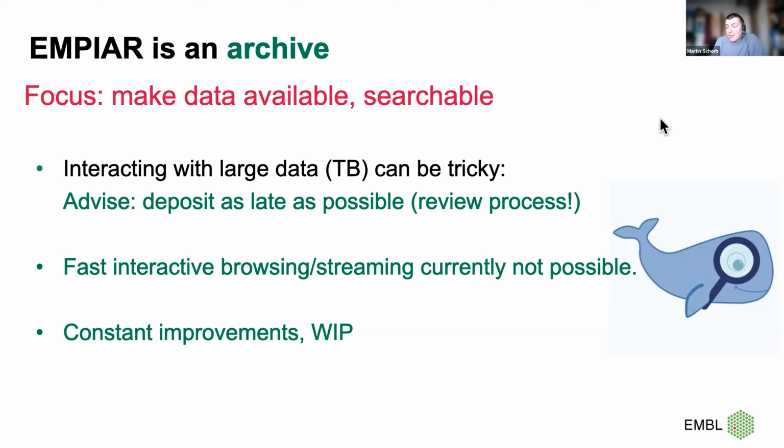One thing that I've found out during the several depositions, and I would say exotic depositions, so no cryo single particle EM data, is that during the deposition process, interacting with these large data sets can be very tricky. I am obviously not suffering from upload times, because we have a direct fiber line to the archive from our institute.